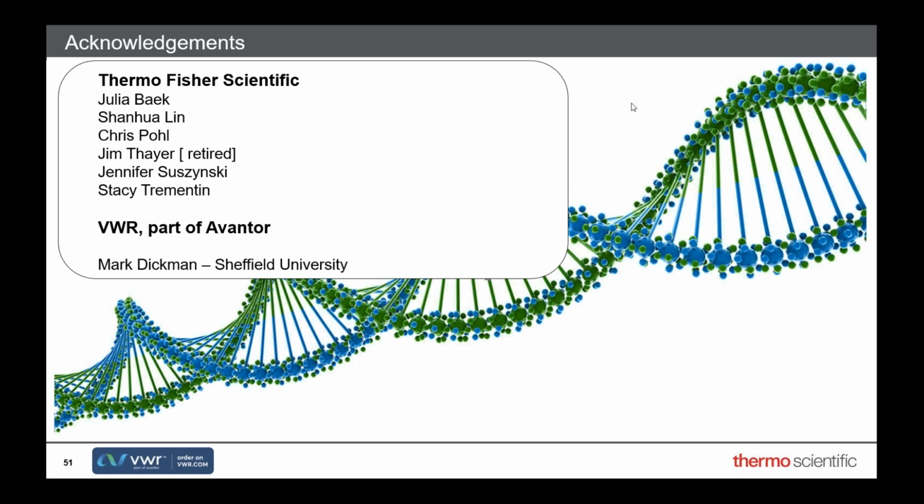What are your recommendations for purity analysis of long oligonucleotides, such as gRNA and mRNA therapeutics? No, if they're quite big, you're not going to get an N-1 separation on something that big. It's not going to happen, whatever column you use. There's a couple of options.